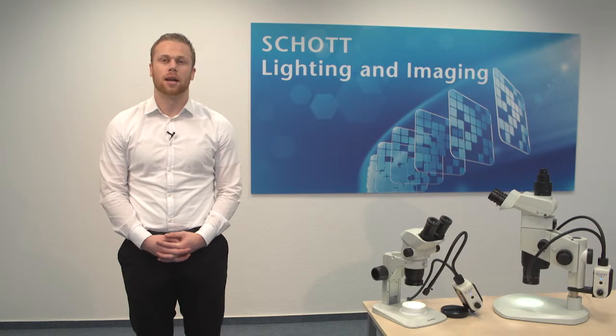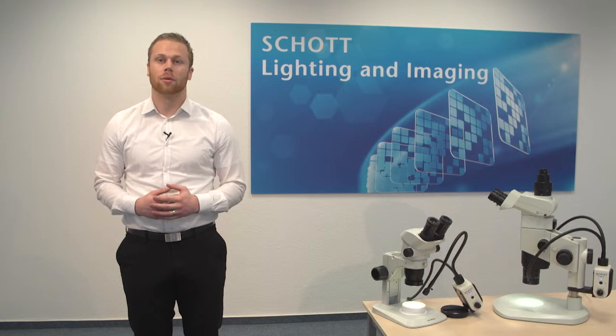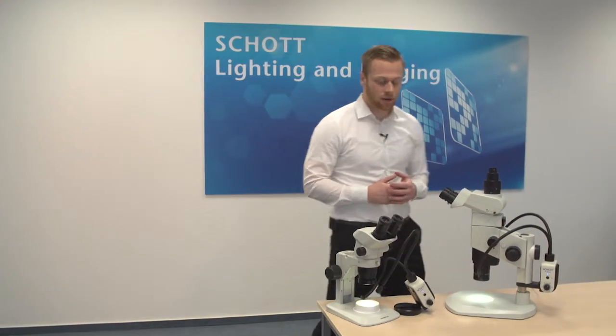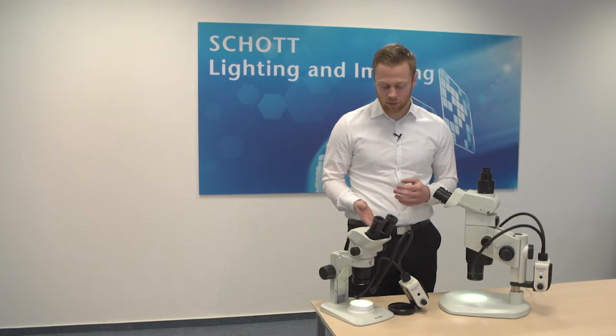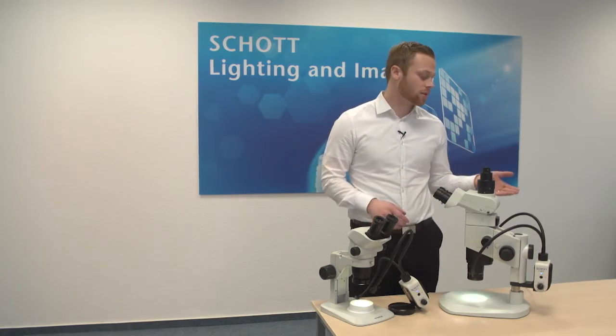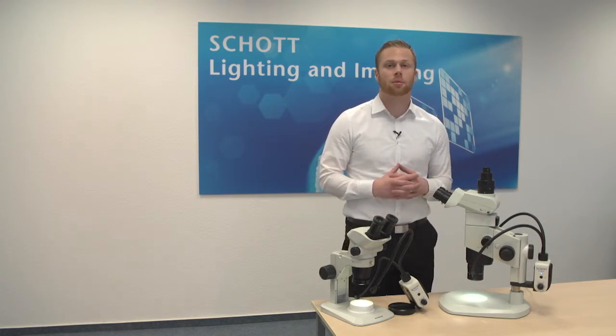Welcome to Shot Microscopy. My name is Preston Zimmerman and today I'll be demonstrating the KL300 LED. There are two uses for this product. As seen here to the right, it can be used as a standalone solution, and to the left it can be attached to a microscope. I'll now show you how to assemble both options.